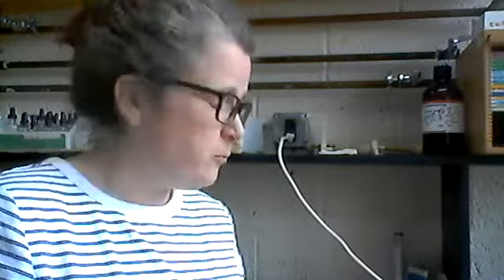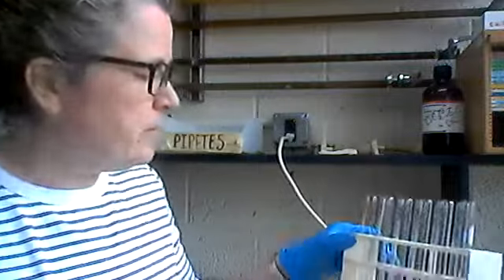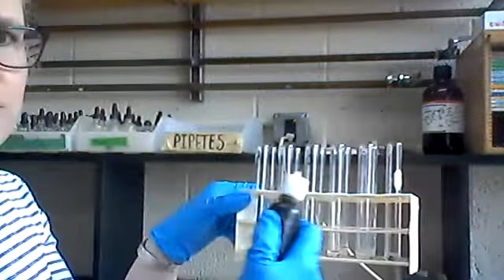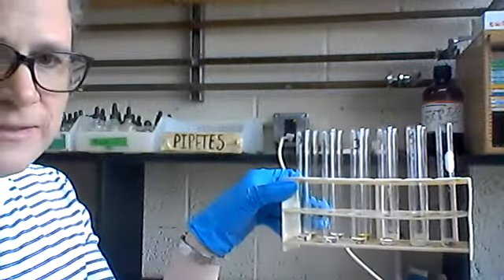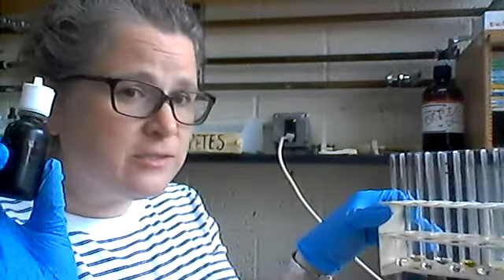Okay, so we're still waiting on the Barfoed's reagent to boil. So we're going to go ahead and do our Lugol's iodine now too. Now this is a little bit different. Again, I've got all of our test tubes with all of the substances lined up. This time we're just going to add 1 drop of Lugol's iodine to each of these.